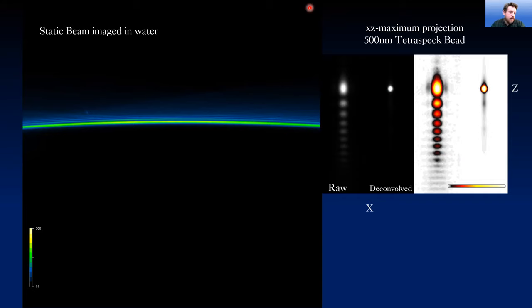back when we first started this about 3 years ago, it was incredibly slow because the software was in its infancy. They have subsequently made this graphics card accelerated, and I think the last time we did this, what would have taken 3 weeks takes 3 hours now to process. We have this installed on one of our workstations at the facility, and it's fairly straightforward. It just takes a bit of processing time. The very large field of view that you saw stitched together with the neurons would take 10-20 minutes to process now. Okay, thank you very much.